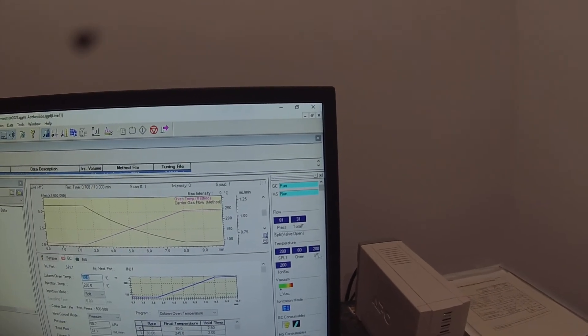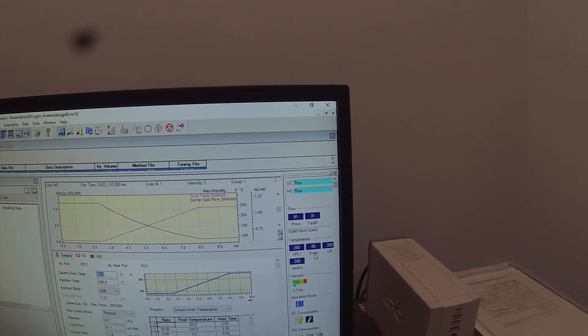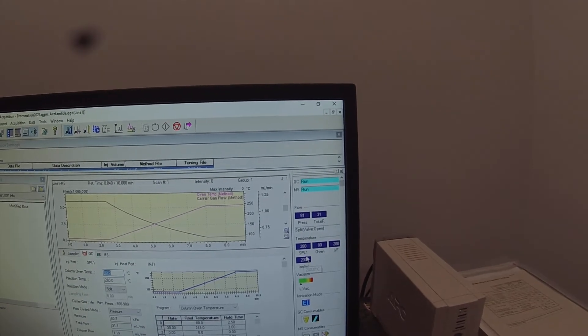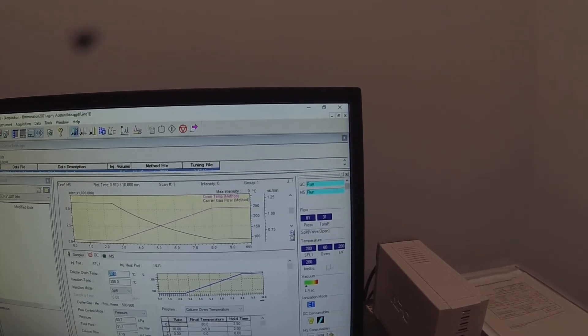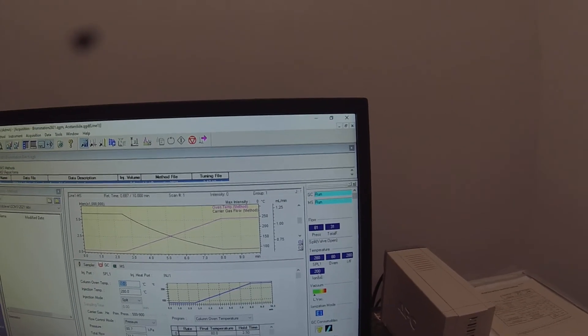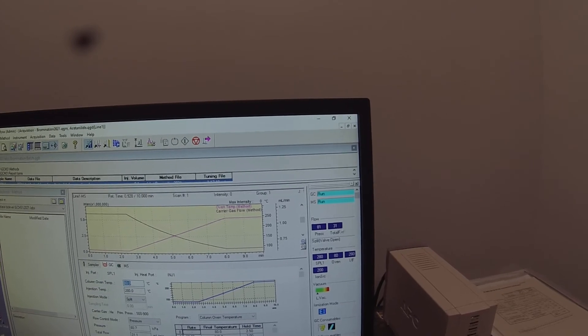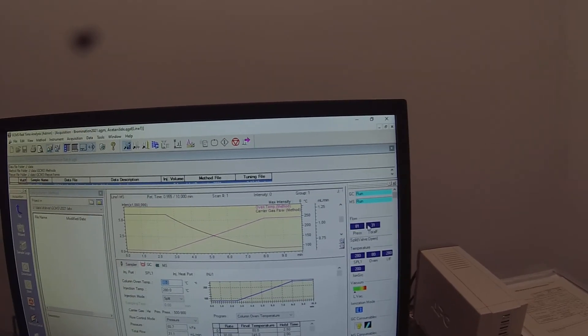SPL1 is the injection port temperature. IF is interface. Those are both at 280. Column oven starts at 80 and the ion source at 200. So there's a quick cheat. And then the pressure at 81 and the 31 at the total flow which you can find.